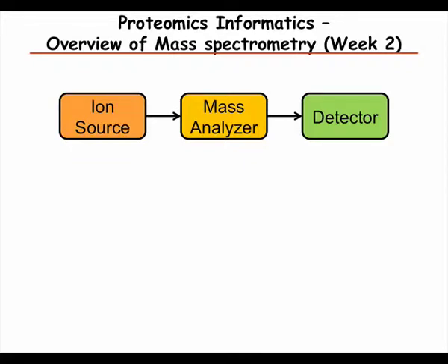Yeah, so today I'm going to talk a little bit about how the mass spectrometer works, and give a little bit more detail on the principles and some technical details also. So as we said last time, the basic mass spectrometer is three parts. One, an ion source to get molecules into the gas phase and acquire charge. Because in general, if a molecule doesn't have a charge, you don't see it in the mass spectrometer. It has to be ionized.